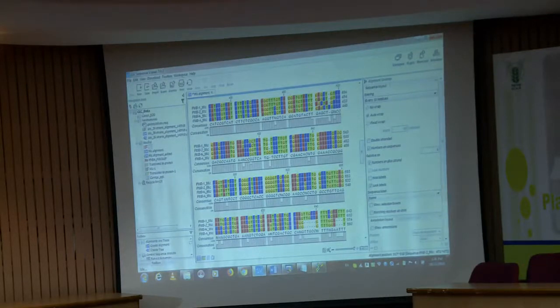Then that is the actual variation in your sequence, in your genome, okay. Then do not change it. You can change only if it is a sequencing related error, process related error. If it is actually the good base in both the sequences, then please do not change this base. Do not do any unconfirmed editing, correct.